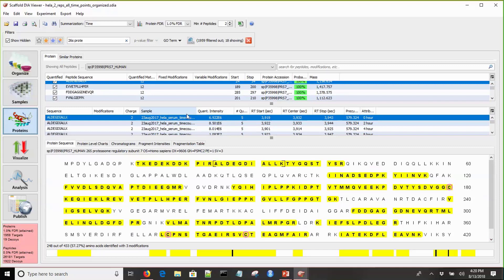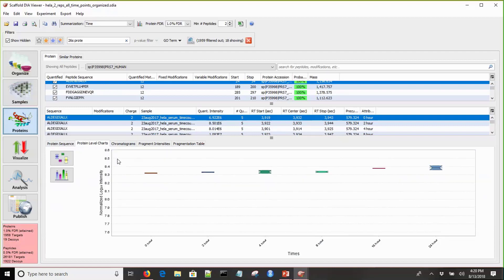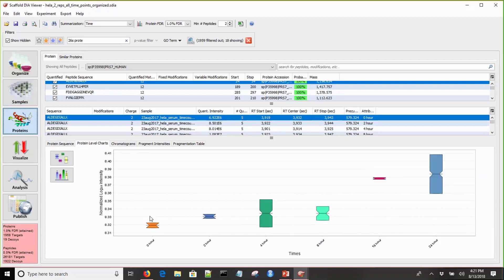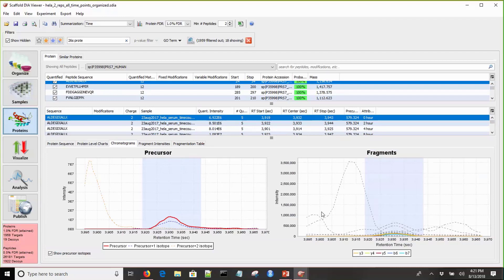Here, this is displaying all of the protein information across all samples, giving more information about intensities, retention times, and everything like that. We've drilled down into an individual protein of interest. We can check out these protein level charts. This plots the intensities across all of the experiments, and we can see that at each time point, there's a difference in the intensity across samples. As indicated, all of the quantitation is done on fragment ion intensities in Scaffold DIA.